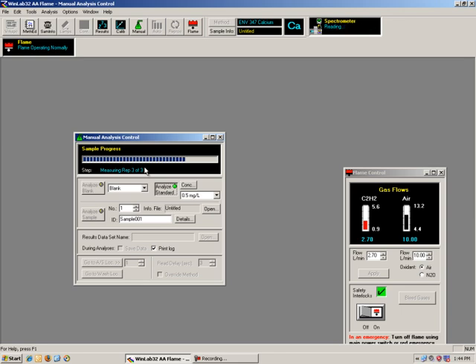And then finally rep 3. And at that point it's done. So again, back to the rinse container with our aspiration tube. It's now telling us to read the next sample. So we'll take it out of the rinse and into the 2 part per million solution. Tell it to analyze that standard.